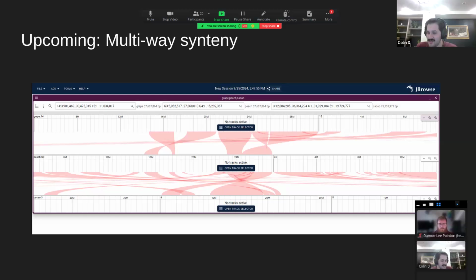The BAM file example is sort of similar, but it also runs up against some more fundamental challenges. So the web browser is a sort of memory constrained environment, and it doesn't really like you to just take all the memory on the computer. So we have to be somewhat smart about things when we try to load a bunch of data. And unfortunately, it's just hard.